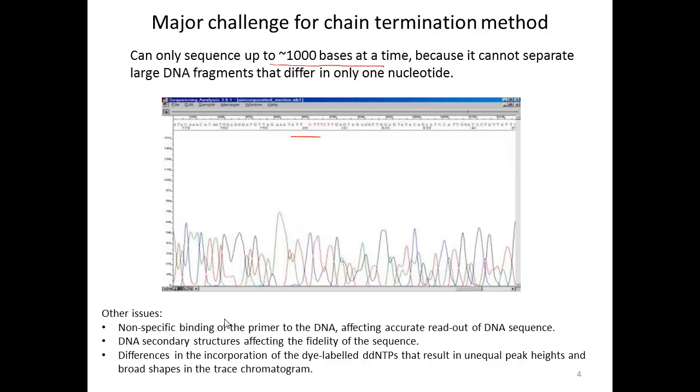If we talk about other things besides just a decrease in base pair resolution, what is causing some of these issues? Well, you always have some non-specific, relatively low-level binding of the primer to the DNA, and so you'll have different reads, and that contributes to the background.